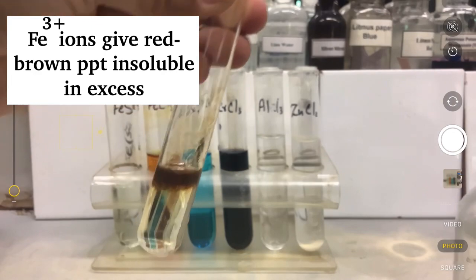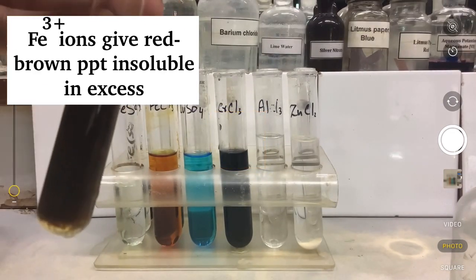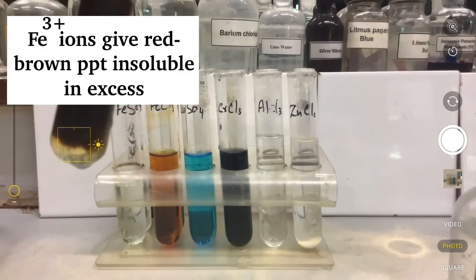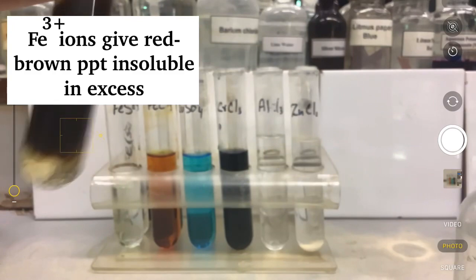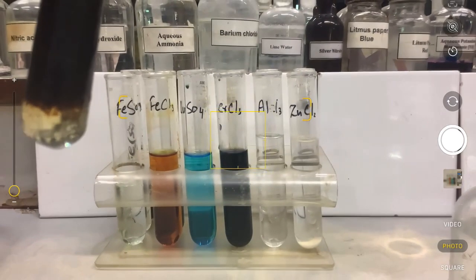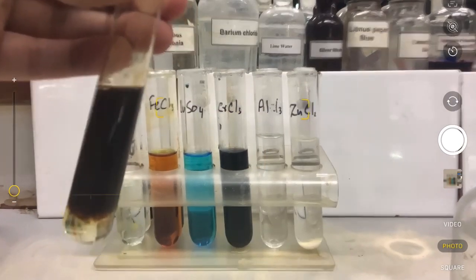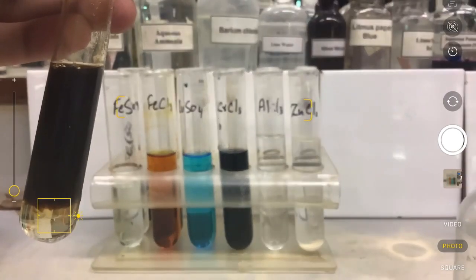You can see that these red-brown precipitates are here and they are obviously insoluble if I add excess aqueous ammonia. The reason is that the iron 3 hydroxide made here will not dissolve in aqueous ammonia or aqueous sodium hydroxide. This is the test for iron 3 ions.